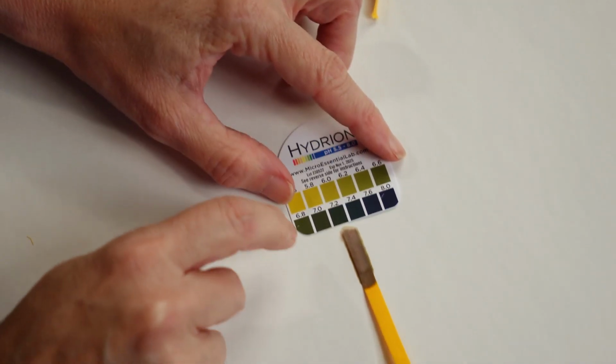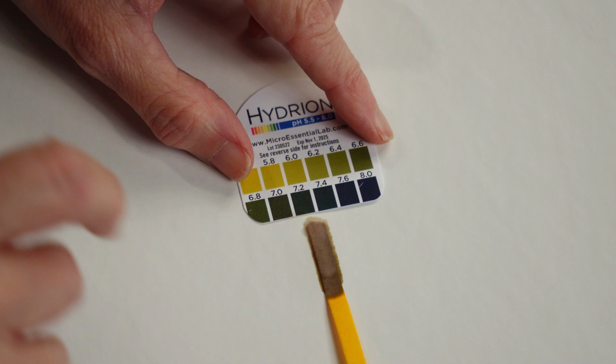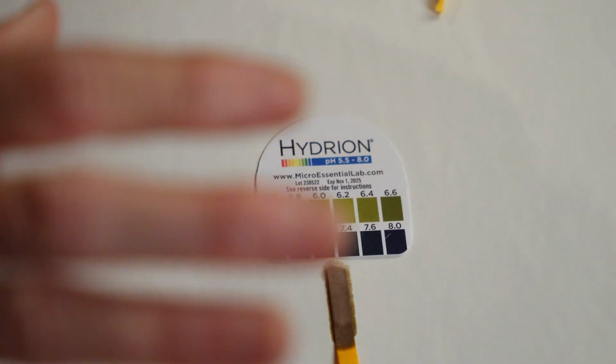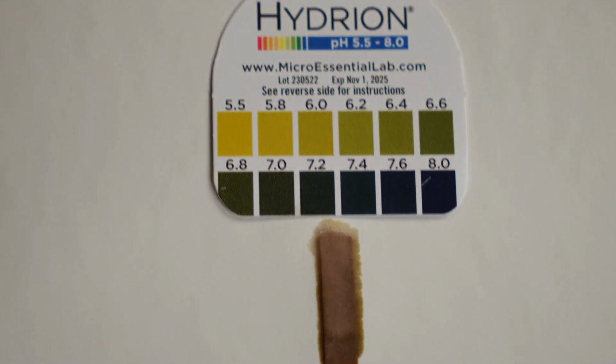green-blue range for sure. So that's going to put the pH, I'd say, somewhere between 7 and 7.4. It's getting a little bit more blue as more time goes by. So that's a very neutral pH. That's very close to our own natural tear pH. All right.